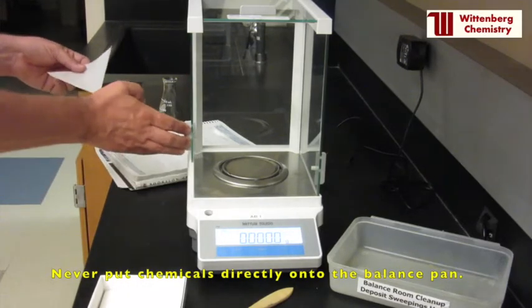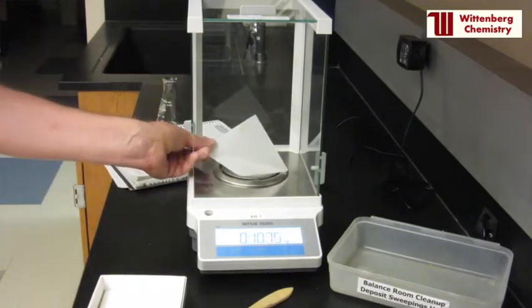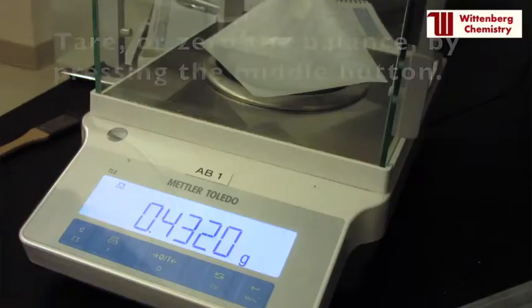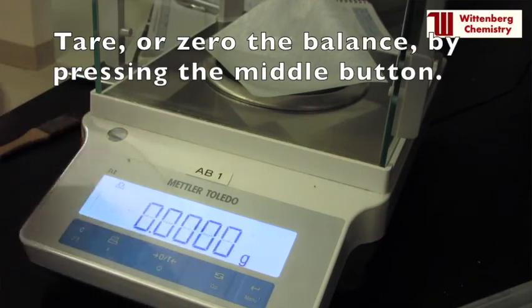Never place chemicals directly onto the balance pan. Tare or zero the balance by pressing the tare button in the middle of the display.